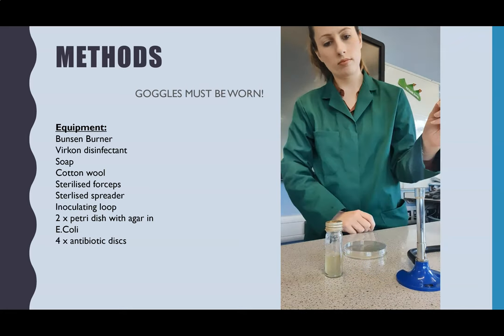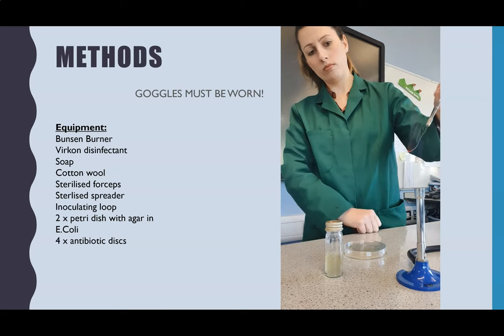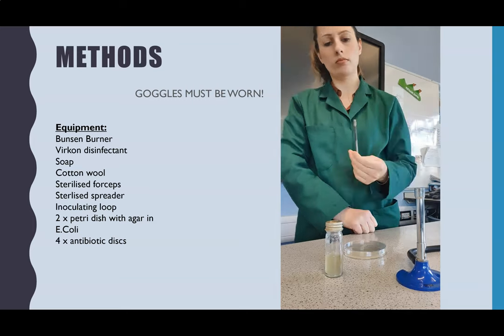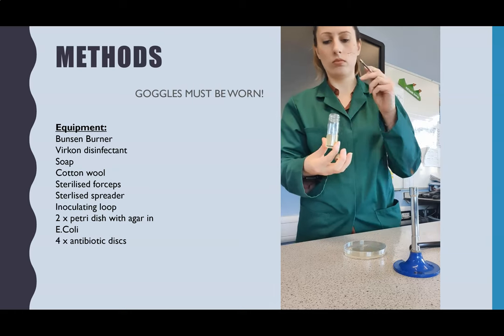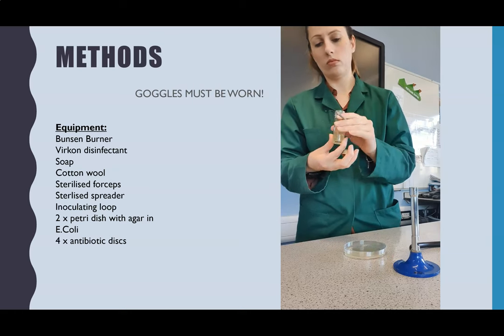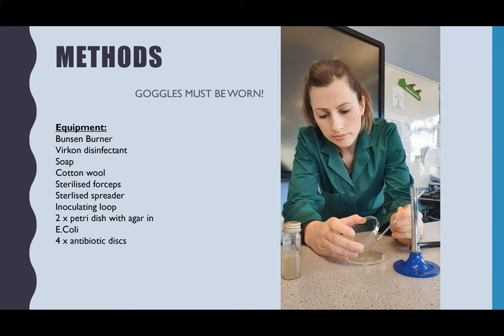I'm going to do the streak plate first. The inoculating loop needs to be at the top of the gas cone, which is the hottest part of the flame — you can see it's so hot it goes right through and becomes sterile. Let the inoculating loop cool down slightly before dipping it in the E. coli, and notice that I haven't put the open bottle down on the bench — I screw the lid on before putting it down.